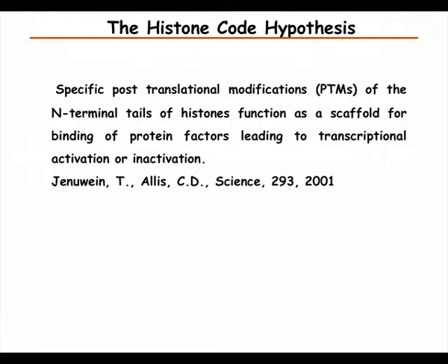But sometimes people first enrich for the protein and then also enrich for phosphopeptides. You can combine these in cases where you suspect, for example, that the site is phosphorylated in only 1% of the protein. Then it's good to do both enrichment steps.